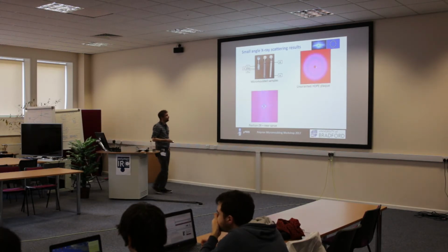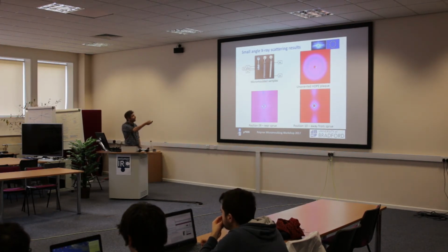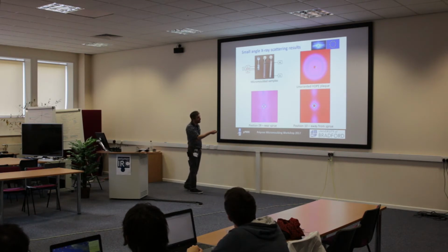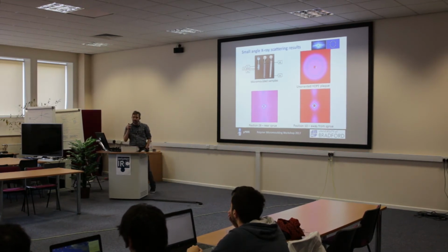Just an example in terms of micromolded samples, something I did years ago, looking at the different regions of these plaques. Look at 9 and 10 in here, you get different orientation in different locations within your part. These were only suck it and see measurements. This is your unoriented polyethylene, nice rings, we know what it all is. And this is what you actually see within a micromolded part. Depending on where you pick, you will see different things, so the resolution at which you can measure these things becomes very important.